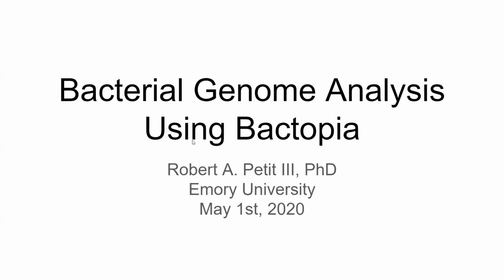And yeah, just taking a break, hopefully, from some of the SARS-CoV-2 madness to get back to some of the bacterial genome analysis and look at this really comprehensive platform for general bacterial genomic analysis that has pretty much all of the QC, taxonomic, and other common public health bioinformatics applications built into a single platform, and also utilizing a lot of the same premises that we try to adopt here at StaPH-B in terms of containerization, workflow management, and everything in between. So with that, Robert, if you want to take over, I'll go ahead and mute my mic.